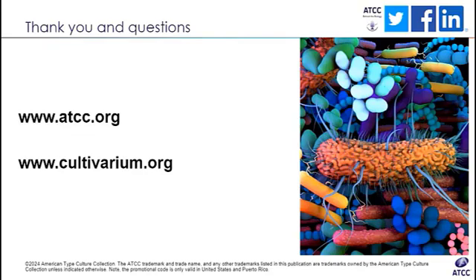Here's another question. What is the OD600 normalized to? Is it meant to be OD600 of a 1 centimeter path length? We use 96 well plates in plate readers, so the normalization is done to the no cell control.